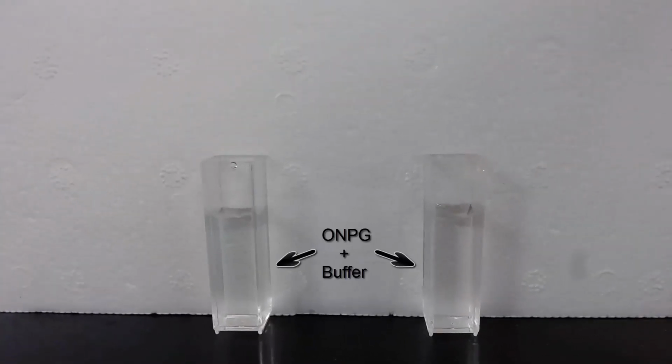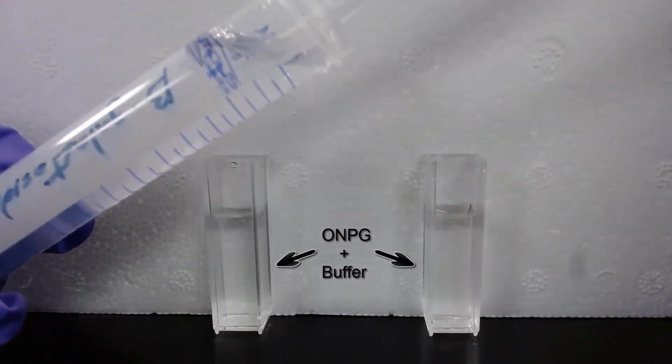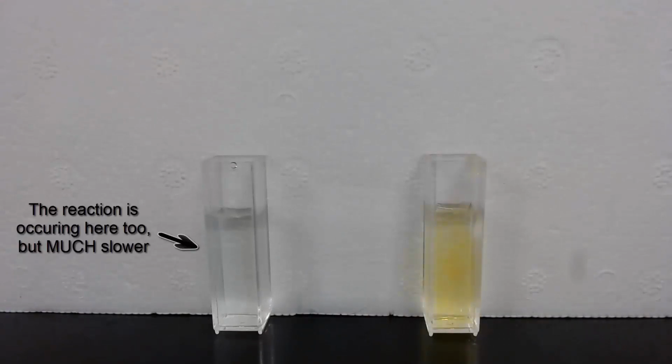Here, I've set up two reactions. In the left cuvette, there is just ONPG and buffer. In the right cuvette, there's the same amount of ONPG, but I'm adding 30 units of beta-galactosidase. As the enzyme catalyzes the conversion of ONPG to O-nitrophenol and galactose, you can see the yellow color develop in the right cuvette.